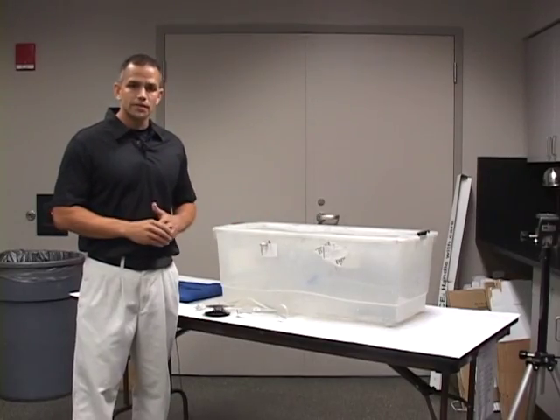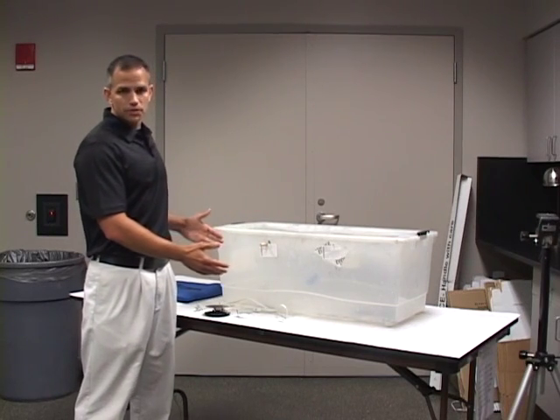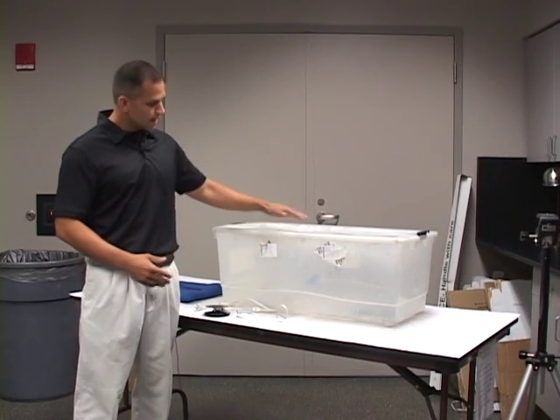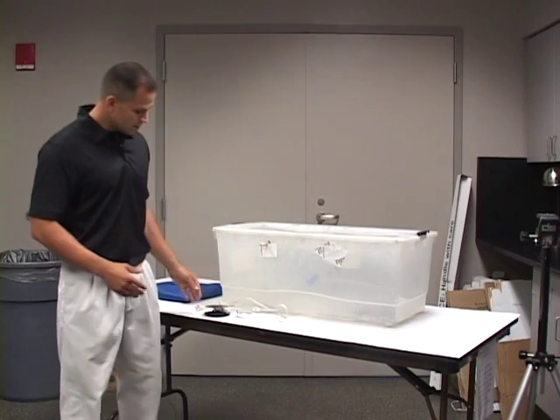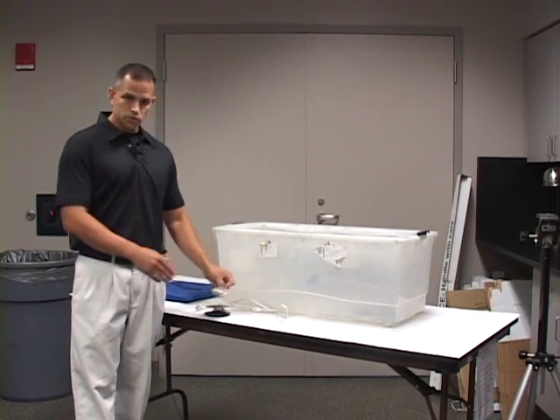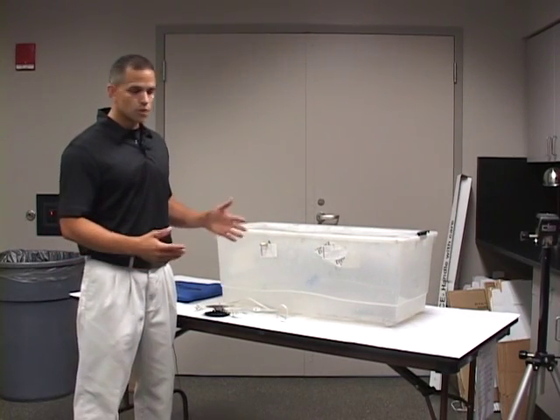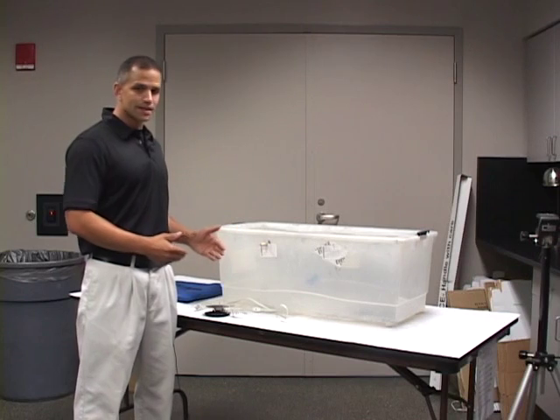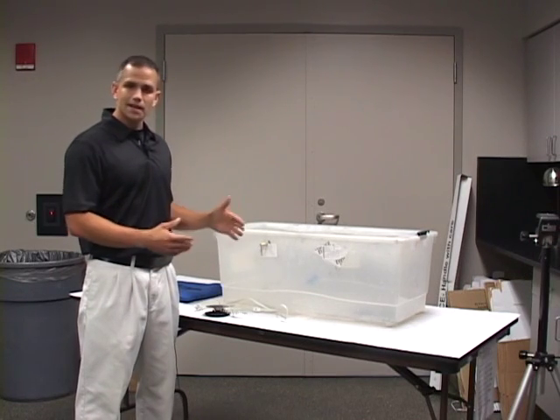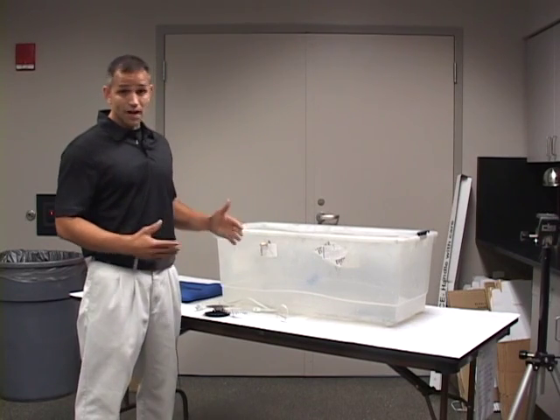If you're an educator or an investigator, this is going to seem familiar to you. This is my portable fuming chamber that I created. I have my plastic bin, my heating element to heat the superglue, and my aluminum to put the glue in. The problem with this setup is one, it's cumbersome — taking it in and out of the car, taking it in and out of a classroom — it's not very convenient, especially if you have more than one.